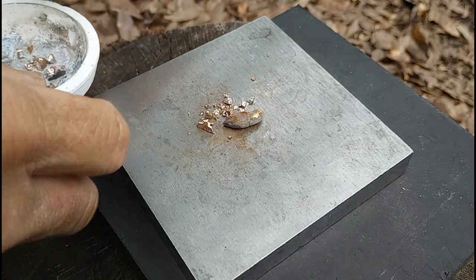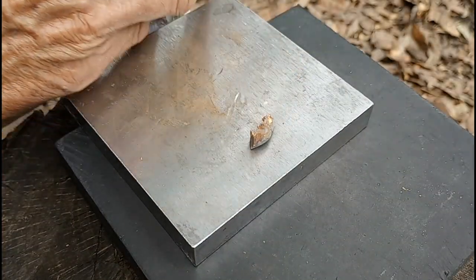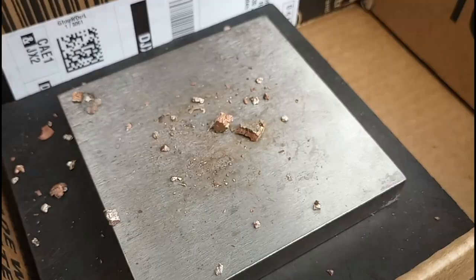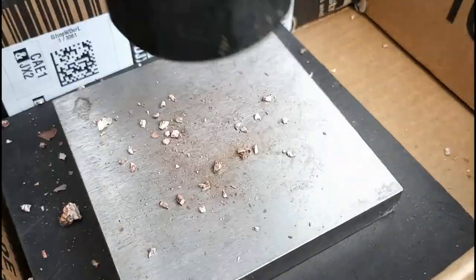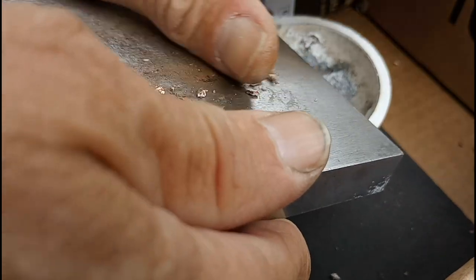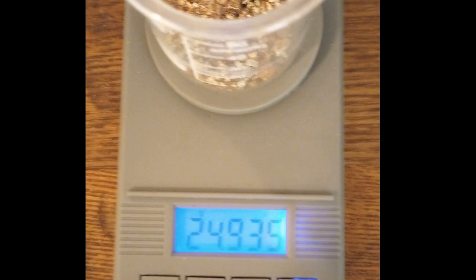So I thought I'd try pulverizing it. Although this was making it smaller, I wound up losing a lot of pieces that bounced off, so I tried the same method inside a cardboard box to catch everything. I would have liked to make the pieces a lot smaller, but since my catch tray was a cardboard box, powder would easily get lost. I got it smashed up to pieces as fine as I was comfortable with, and the resulting weight was twenty-four point nine three five grams.